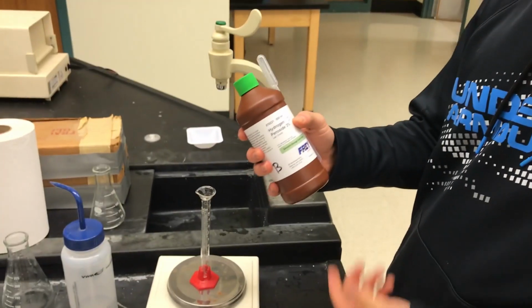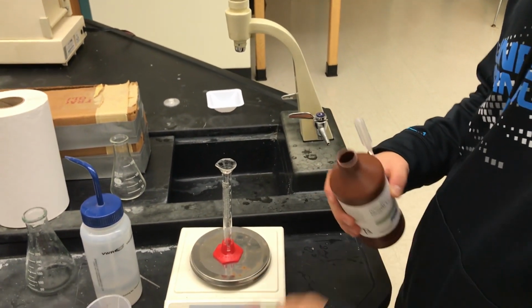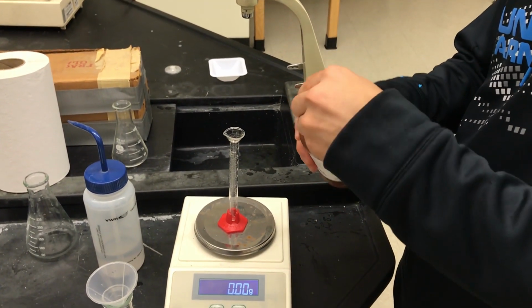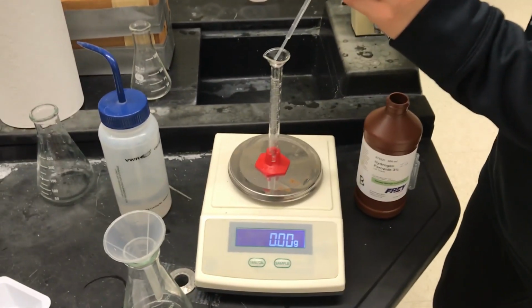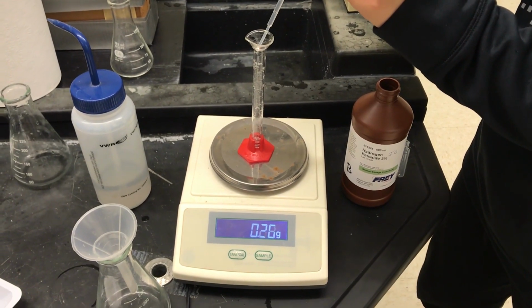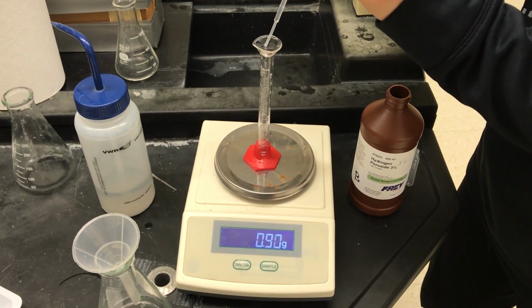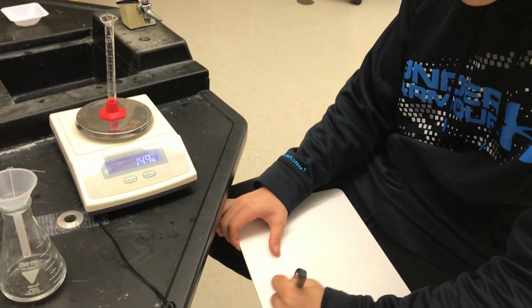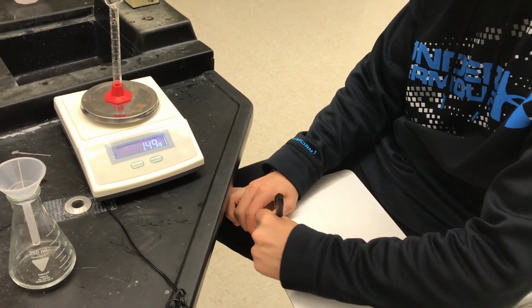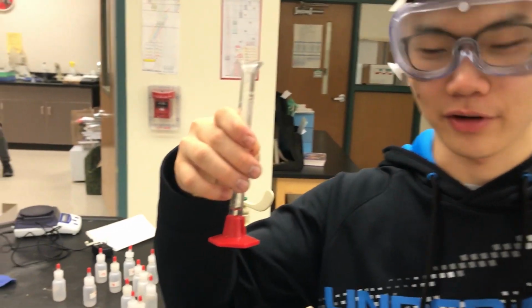Alright, so we have to measure about 1.5 grams of hydrogen peroxide. To do this, you have to open the cap and take a squirt and carefully squirt a little bit of hydrogen peroxide until it reaches about 1.5 grams. It doesn't have to be exact, but it has to be close. Don't forget to record the mass of the hydrogen peroxide before moving on. Oh yeah, and don't forget to record your volume for your H2O2.